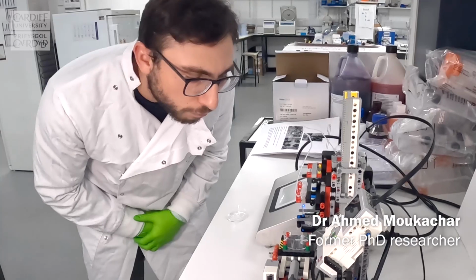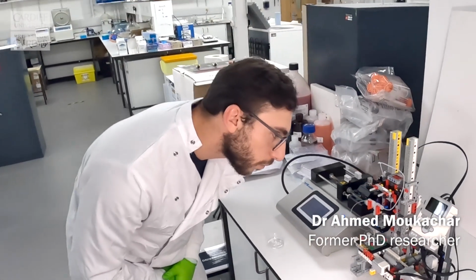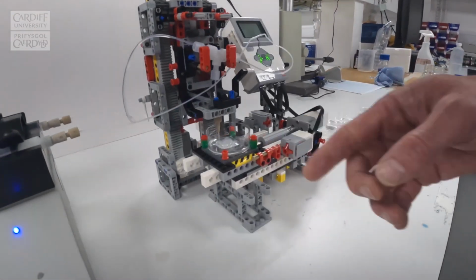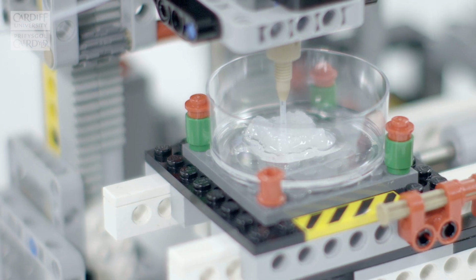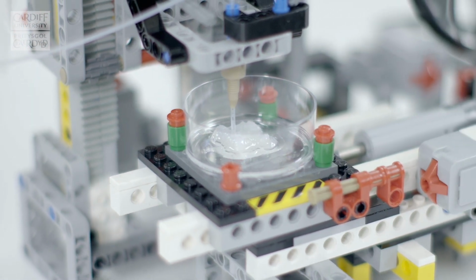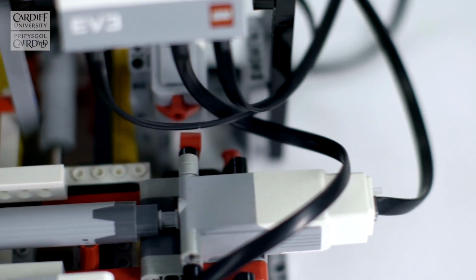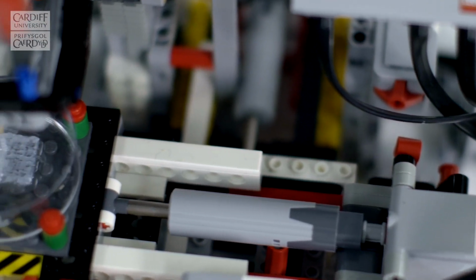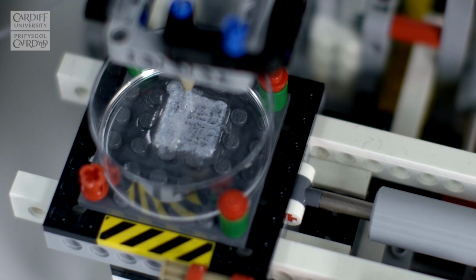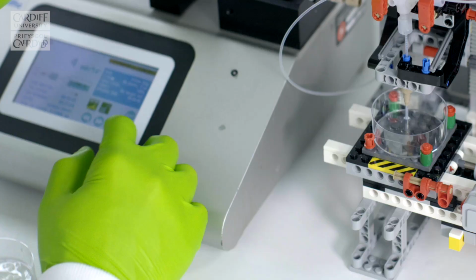I should introduce Dr Ahmed Moukachar, who's done lots of the work on this particular printer, and this is the LEGO printer itself. If I take you to this small plastic dish, you'll see a steady flow of droplets coming out of the nozzle, and each of those droplets is a gel-like substance which contains a host of different cells. Ahmed and a number of other talented researchers and students who've worked on this project over the last few years have developed a range of different patterns that we're able to use.